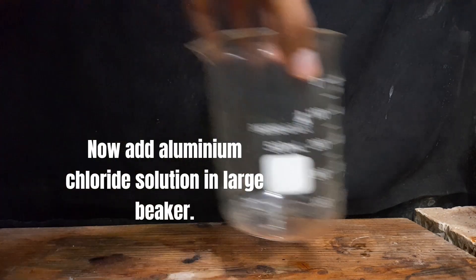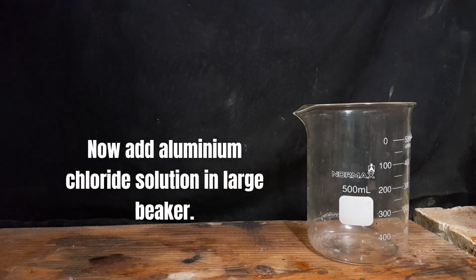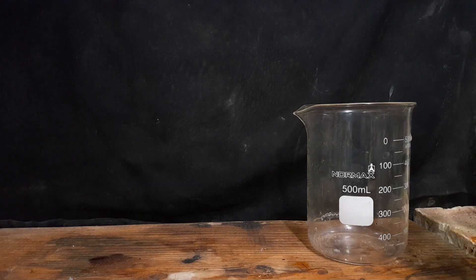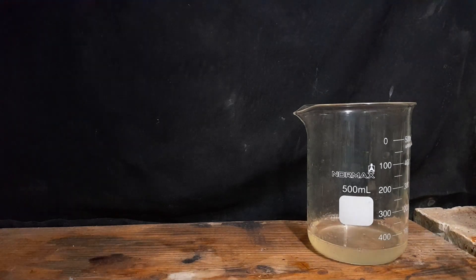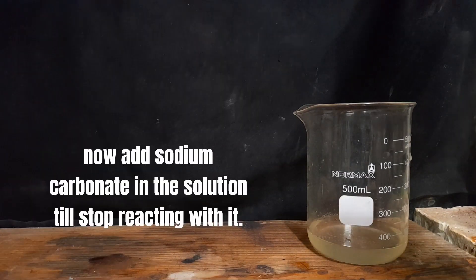Now add aluminum chloride solution in large beaker. Add sodium carbonate in the solution till stop reacting with it.